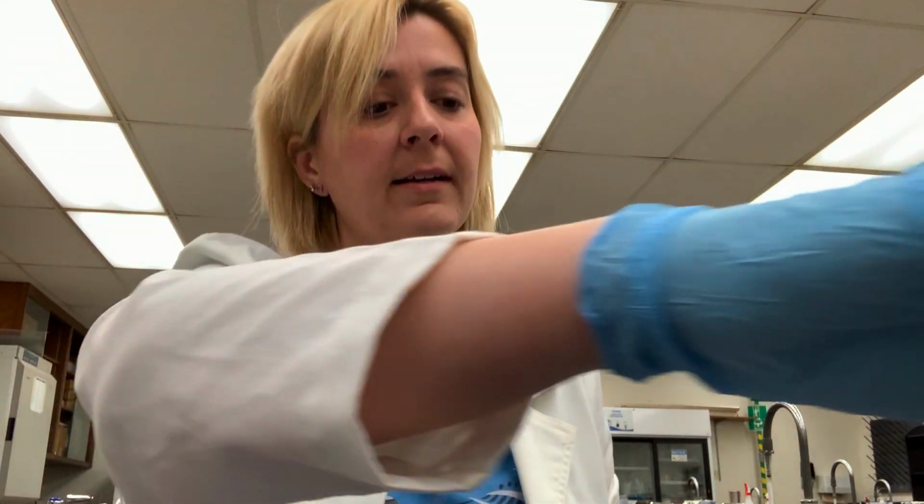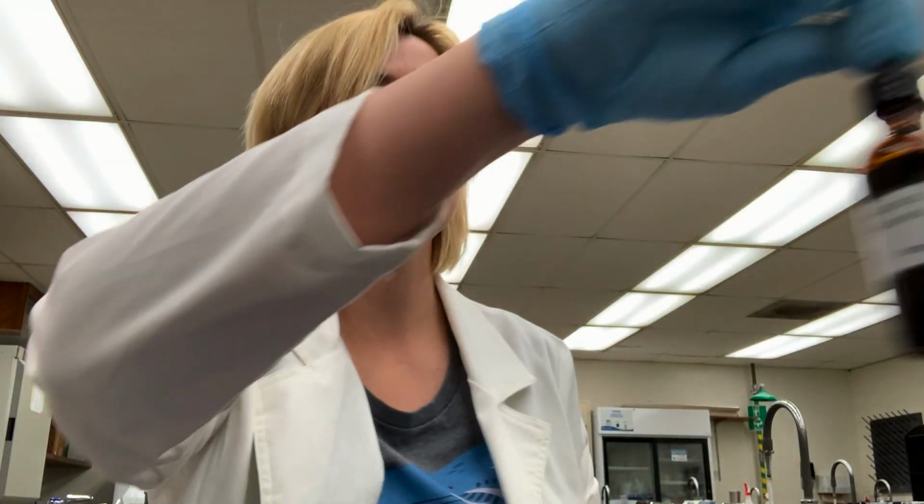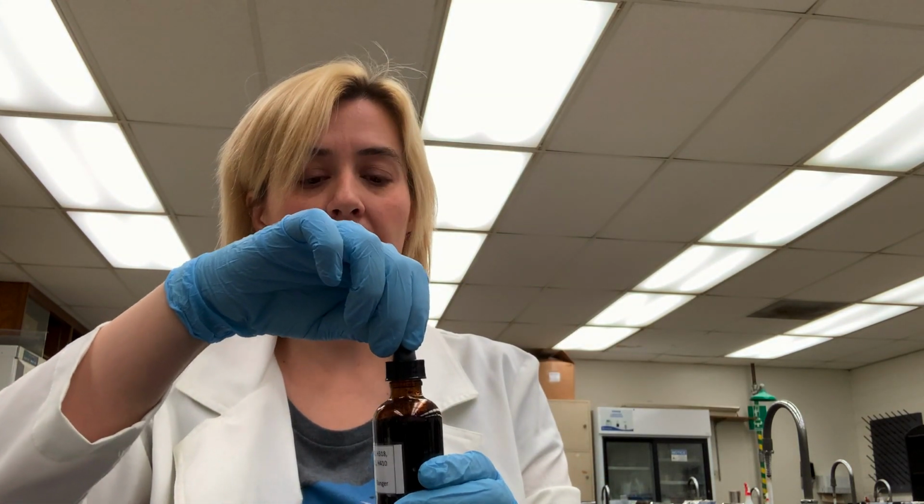So with the E. coli, I'm going to go ahead and stain them with crystal violet, and we have all of the stains at the lab bench. For crystal violet, let's see here, there it is. I'm going to cover the smear that I made with the stain.